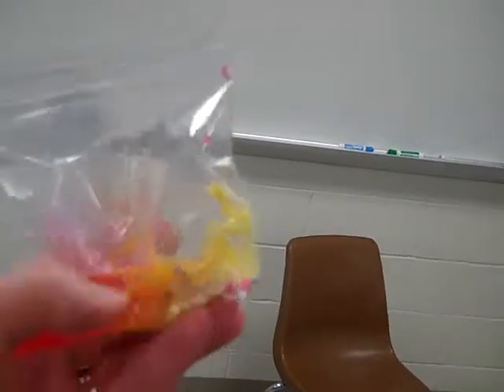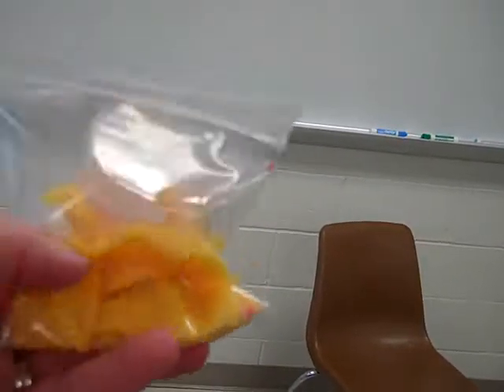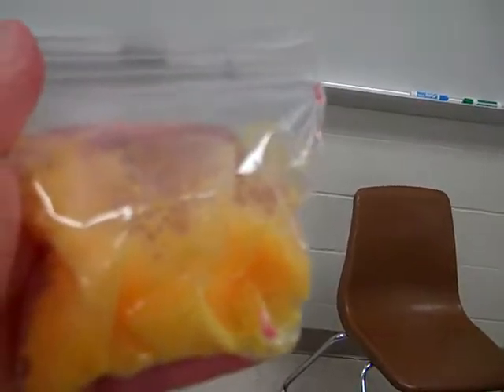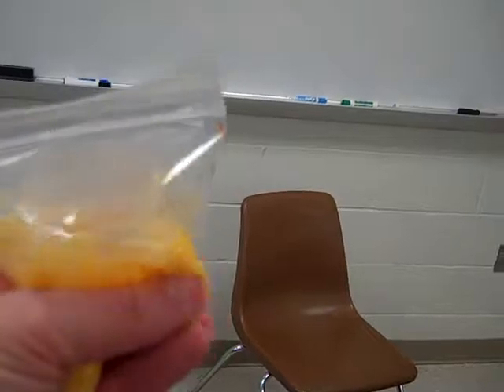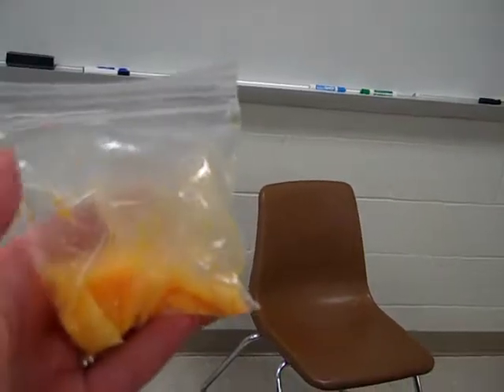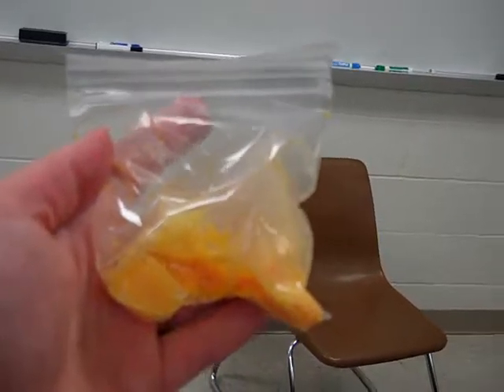Okay, so that phenol red is red in color. Okay, right away what I'm noticing is that the bag is getting warmer. There's an obvious color change from red. There is bubbling that is occurring. The bag is filling with gas. So again, we need to assess whether this is an example of a physical or chemical change.